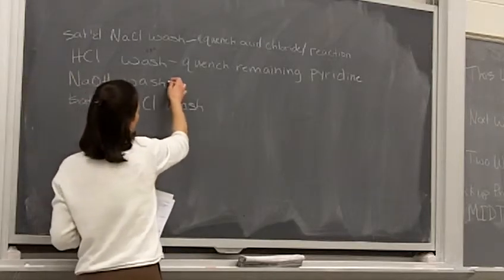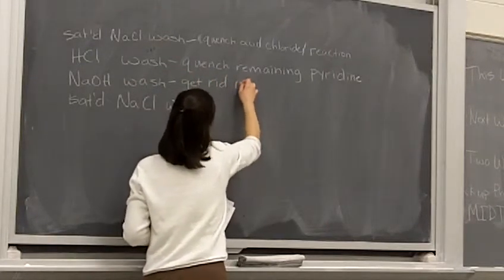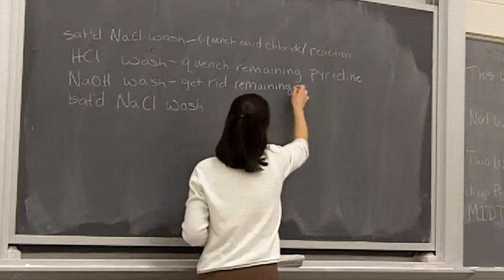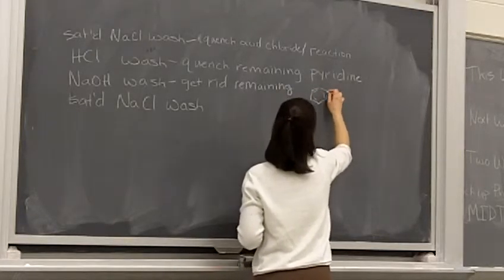Then this guy is to get rid of, so our sodium hydroxide wash is to get rid of remaining starting material, your methyl 4-hydroxybenzoate.